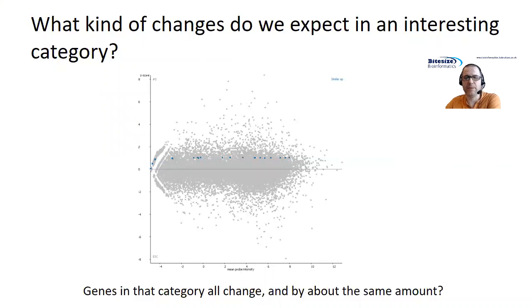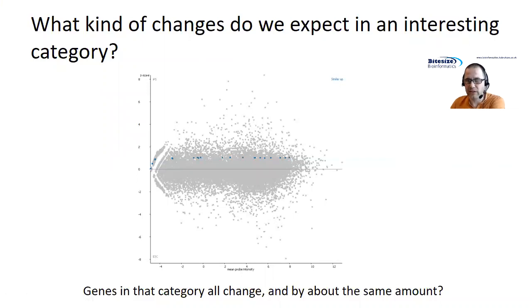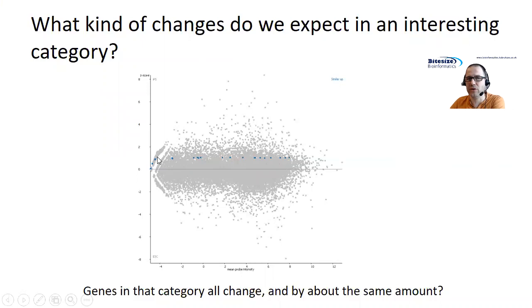We need to think about what sort of pattern of expression change we're expecting to see. We can be quite strict about this. We can say: I want all of the genes in my category to change, I want them all to change in the same direction, and I want them all to change by about the same amount. In the example on screen here, the highlighted genes are a functional set that is super interesting — you can see they all go up and they all go up by about the same amount. That's quite a harsh criterion, but if we can find it, great.